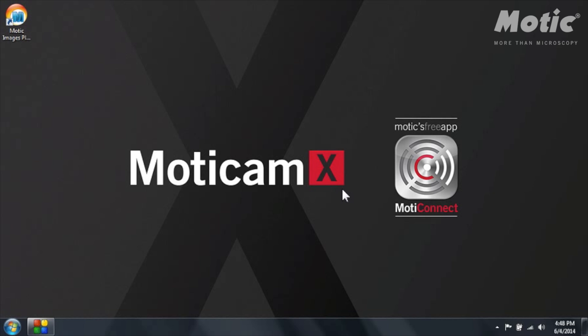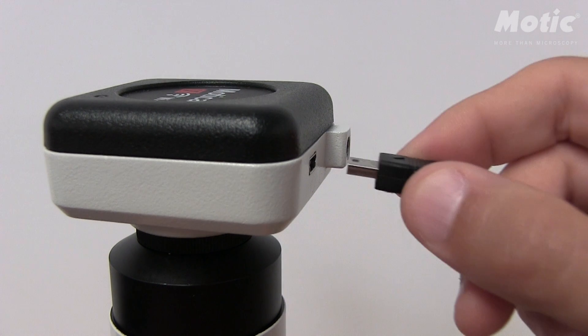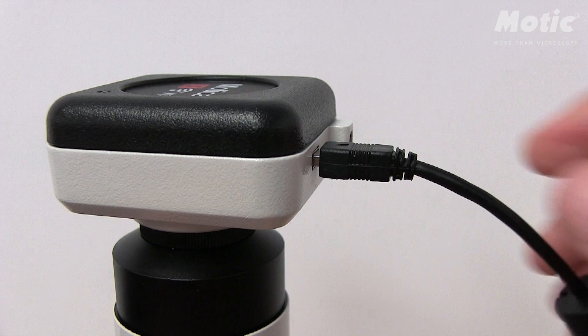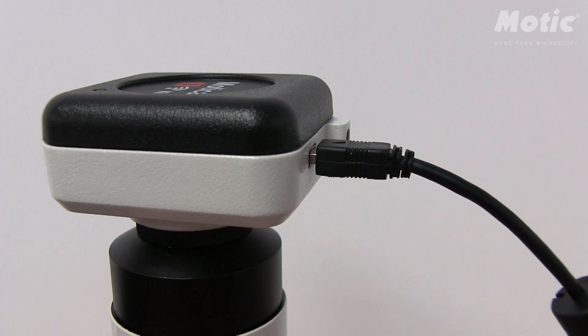Of course first you have to connect the camera to the power supply and you can do this using the USB connection of your computer or using the power plug that's included in the Modicam box.